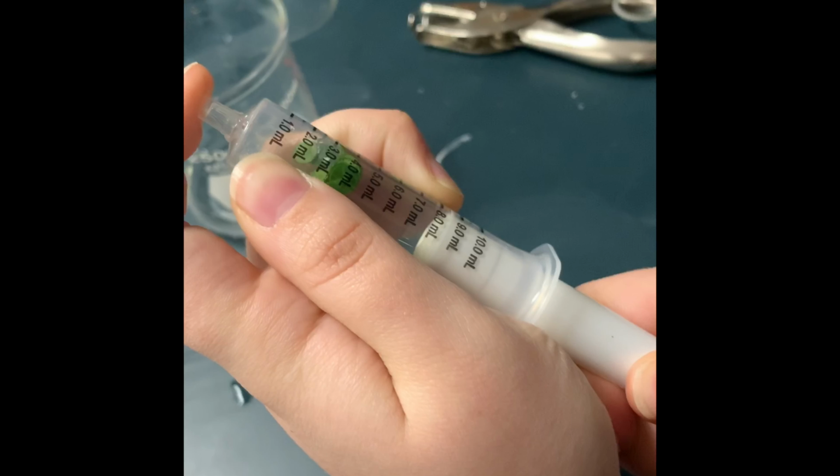Then, you will slowly let out the vacuum and repeat it 2 or 3 times until all leaf discs sink. However, you should be careful not to yank off the plunger because, yes, it can spill. And also, you could damage your leaf disc.